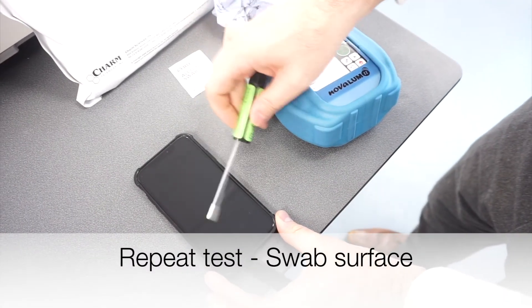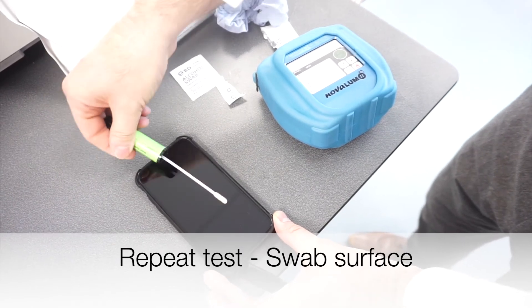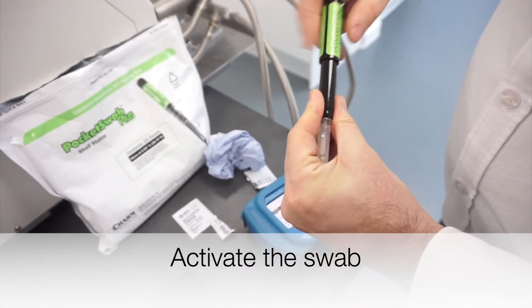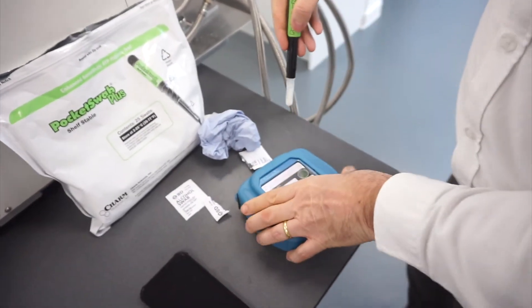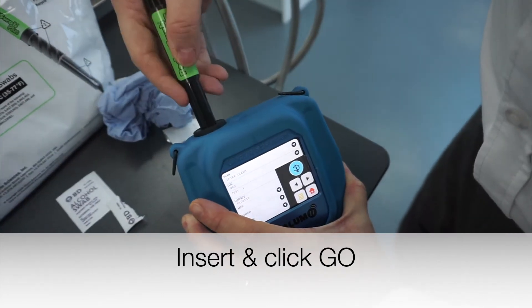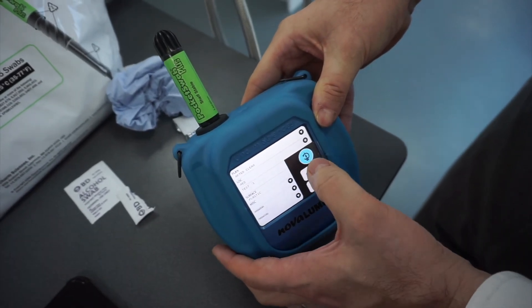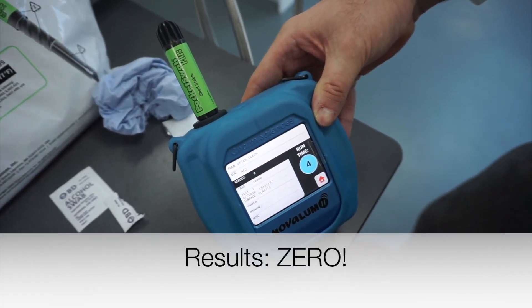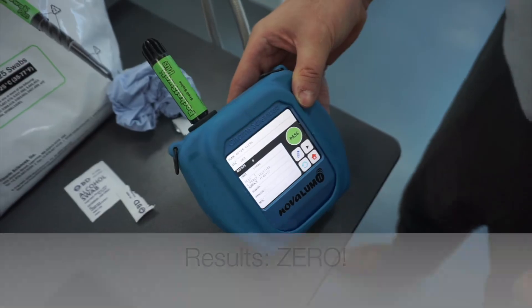So swab, activate the swab, just go back to home, press and then click go. Five seconds later, a zero result.